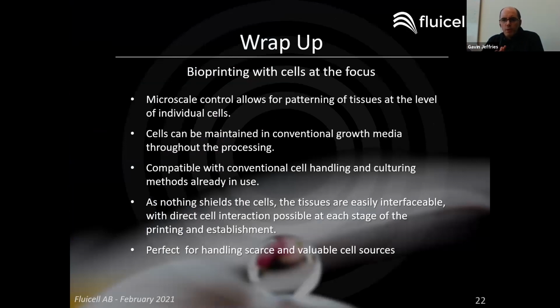I just want to wrap up with a few of the messages that I hope you can take away with you today about bioprinting with the cells as the focus. Microscale control allows for patterning tissues at the level of individual cells. You can do this by looking at the cells themselves. And these cells can be maintained in growth media throughout the process. This has the benefit that it is compatible with most conventional cell handling and culturing methods. There's no real need to change workflow. This can fit into most people's current workflow schemes.